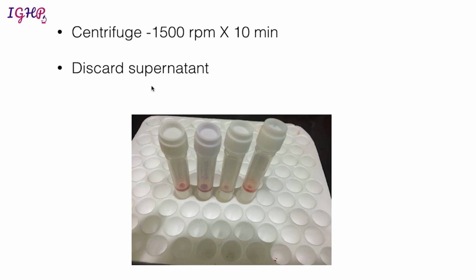There are different other methods also by which you can make a cell block, and a beautiful paper on it is by Dr. Dipali Jain, who has done a thorough study on the cell block preparation.